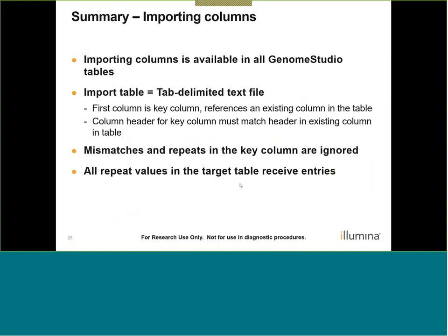All right? So, to summarize, importing columns is available in all GenomeStudio tables. Import table is a tab delimited text file. The first column is the key column, and it references an existing column in the table, and the column header for the key column must match the header in the existing column in the GenomeStudio table.